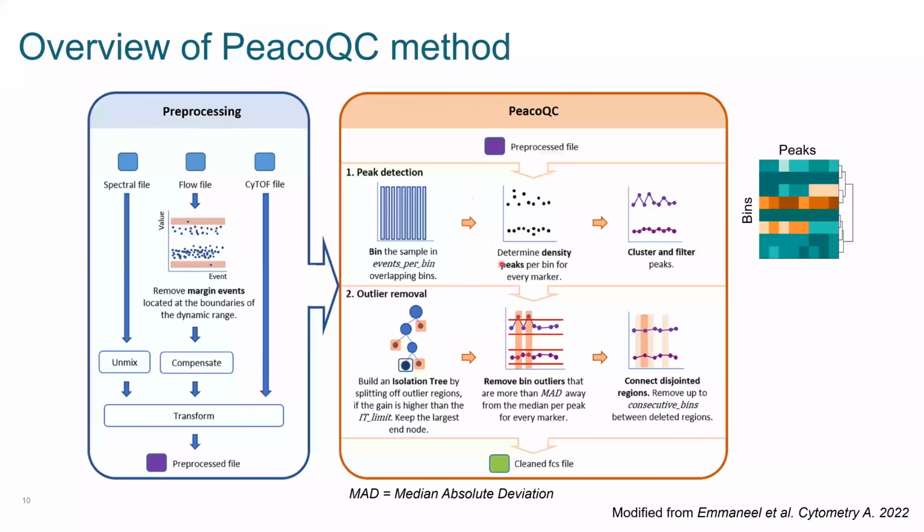And then when we get all of those values for every bin, right, for all the samples, then what happens is we form some kind of a matrix, right? So this is just a very oversimplified view of what that matrix would look like.